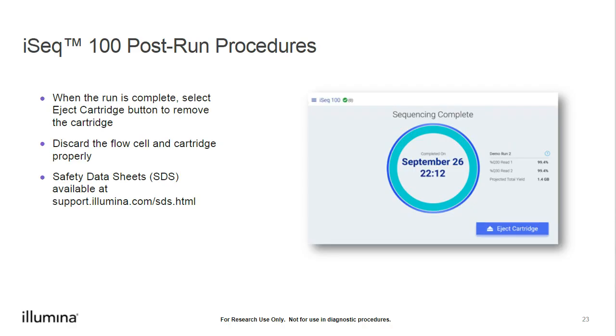So moving on to what happens after a run completes. Again, those basic run metrics are displayed on the screen, showing if that run meets specifications. That slide that I provided earlier can be a good rule of thumb. Was this a good run? You can use that resource there. And then, if everything looks good, you can continue on with data analysis for that run.